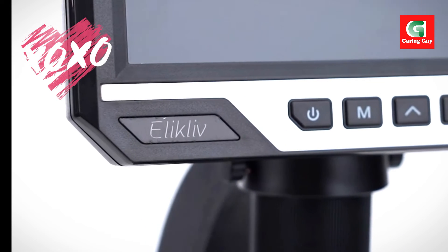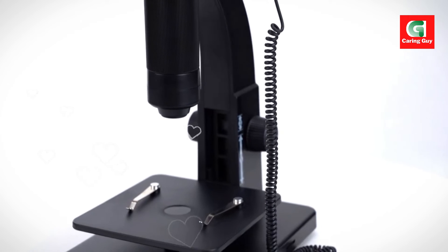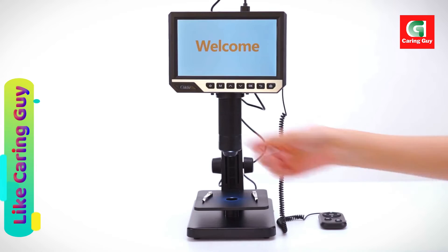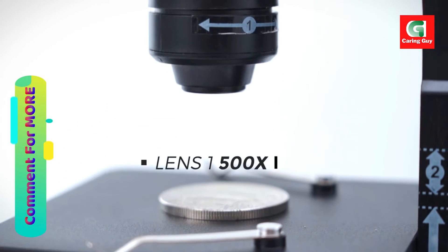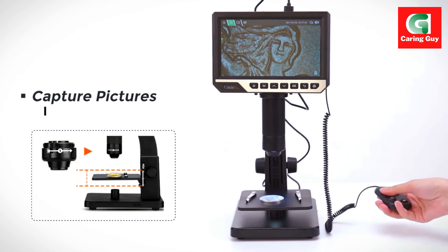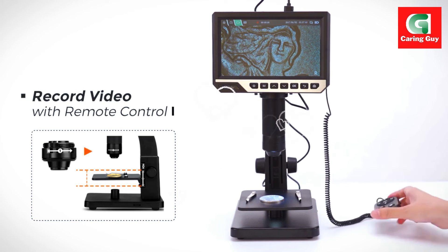The video microscope is compatible with Windows XP, Vista, 7, 8, and 10, or Mac 10.5 and above. This compatibility enables users to connect the microscope to a computer, facilitating high-definition video and picture recording on a larger scale, and provides an accurate means of measuring specimens for detailed analysis.